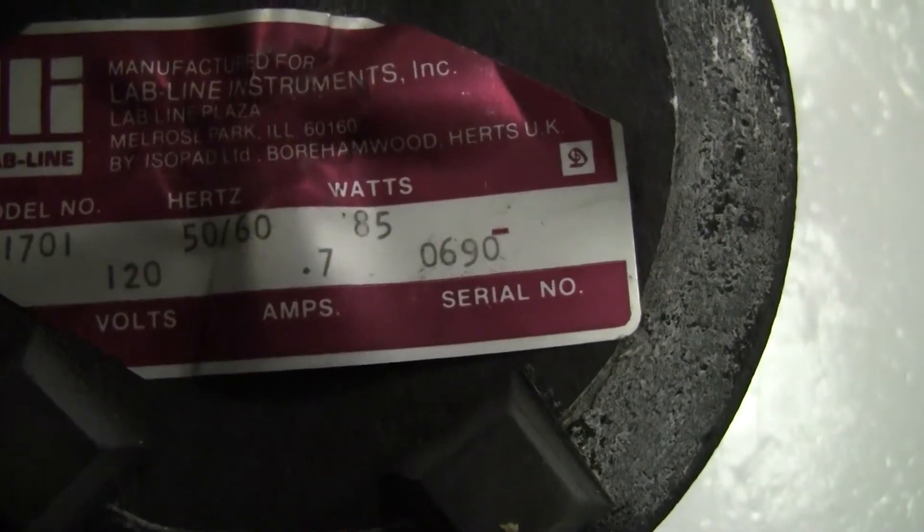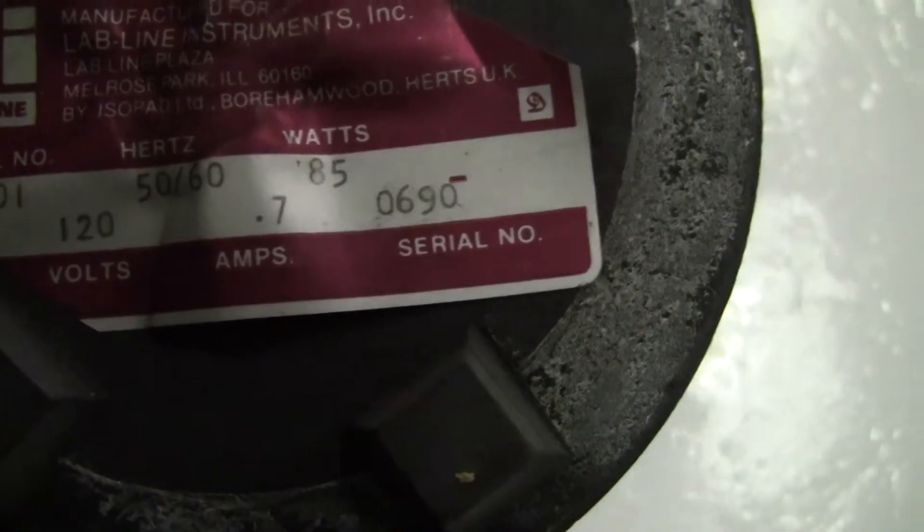It has 85 watts, 0.7 amps, 120 volts. Good little thing.